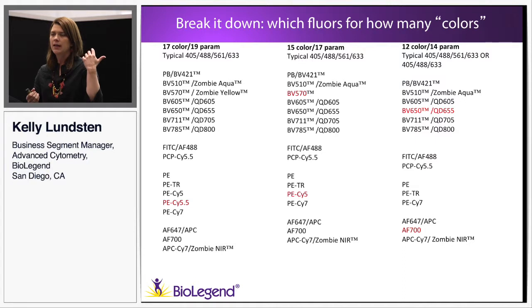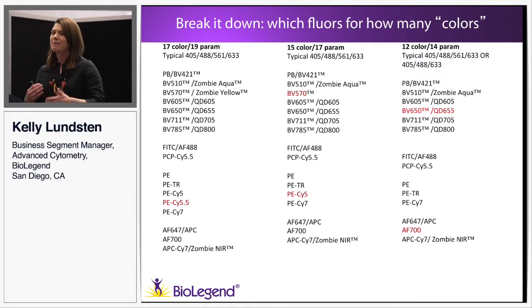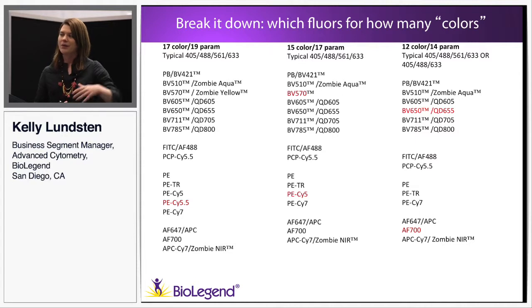All right, so initially when I first started, when I moved to San Diego to work at the home office, people would ask me, what is the logic by which you make the choices for the panels that you construct? And I mean, these fluorophores are my family. I've been working with these fluorophores since I was 24 with Molecular Probes. I have a very innate knowledge of them. And I realized that maybe this doesn't come as naturally to other people. So I started creating what I believed to be the logic of my reasoning.